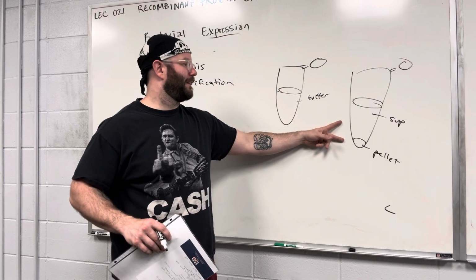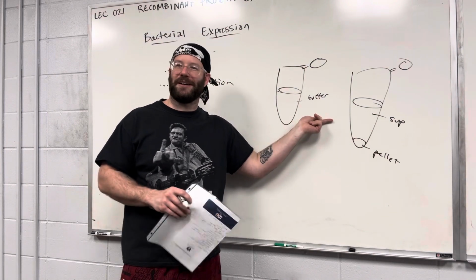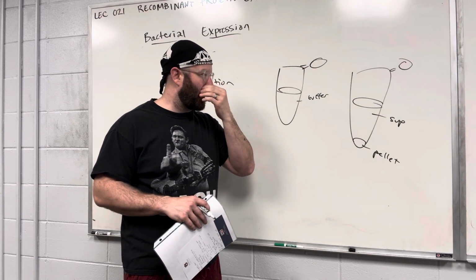It's pellet, but I don't know exactly why. You think it's pellet? Does anybody think it's soup? I think it's soup. Why do you think it's soup? Because the rest, it's like the heavy cell wall stuff fell to the bottom.